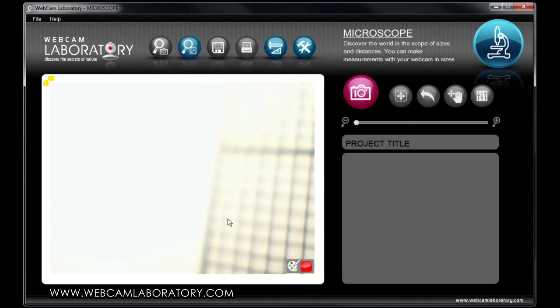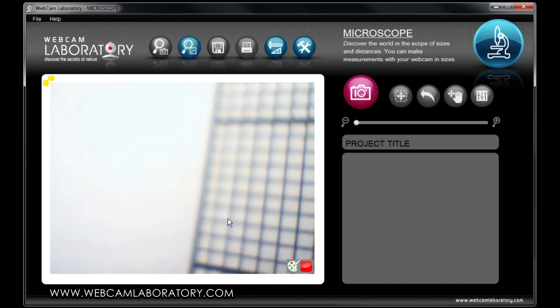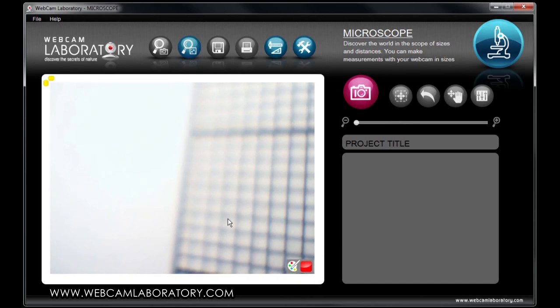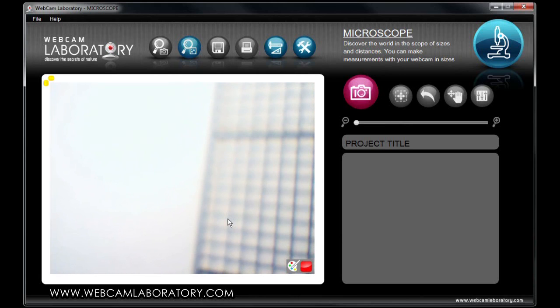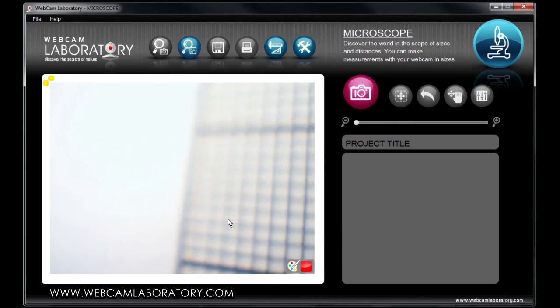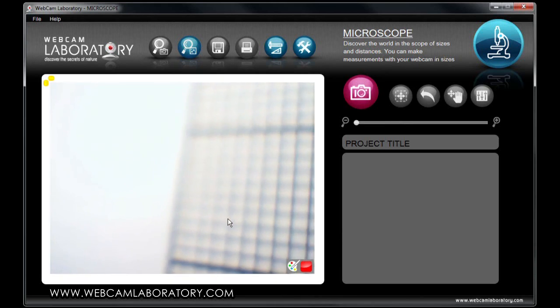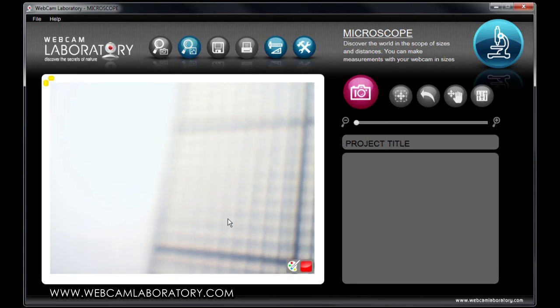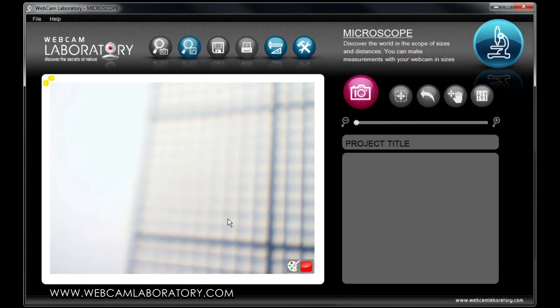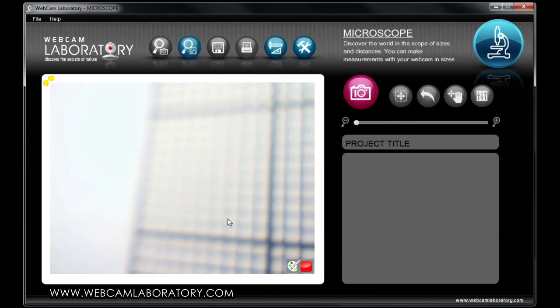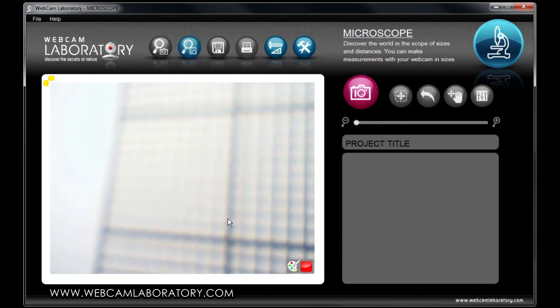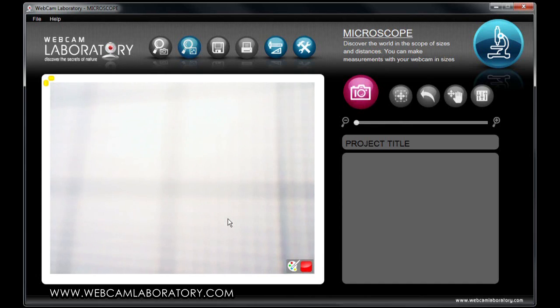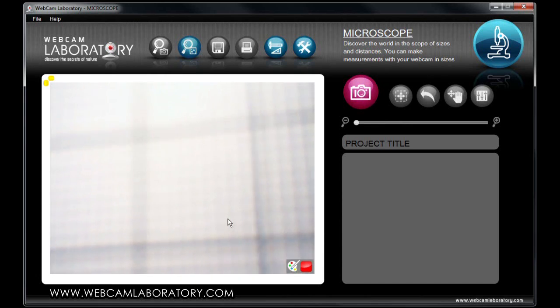The camera feed appears in the left-hand part of the screen. It is not common sense that you can make extreme close-up pictures using your webcam. All you have to do is pull out the focus to the utmost extent, and you can take pictures of very, very small objects. There are certain everyday webcams that will allow you to observe even single-cell organisms.